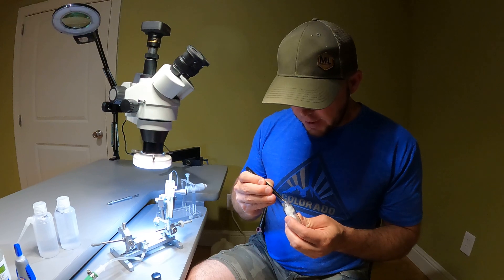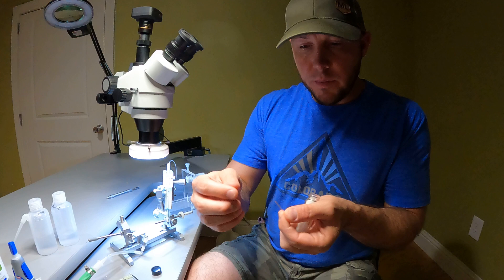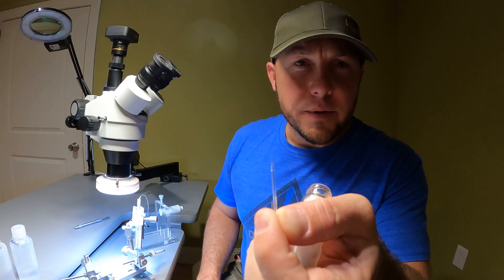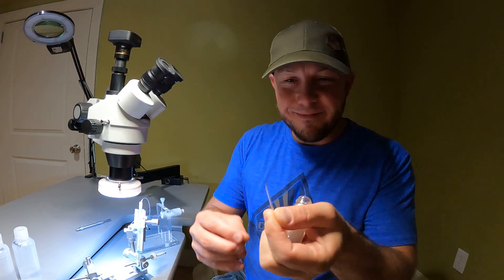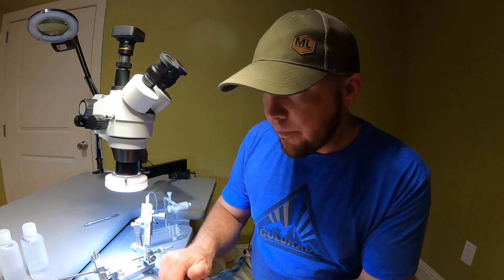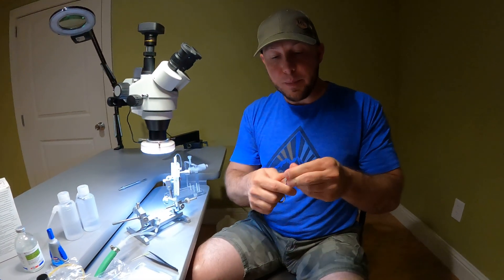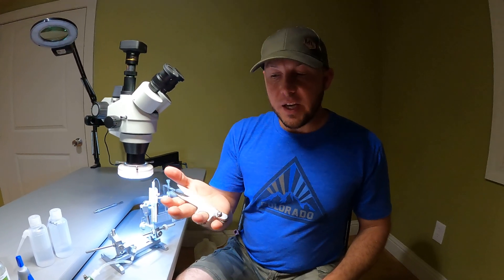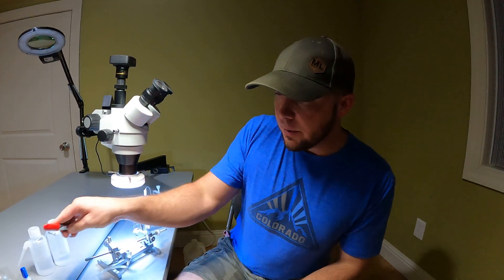We use small glass tips to collect the semen and to administer it. The end is very tapered — it's just a small glass tube. I also like to keep a pair of clippers around. You can get them at any bee supply store, or sewing shops would likely have them too.